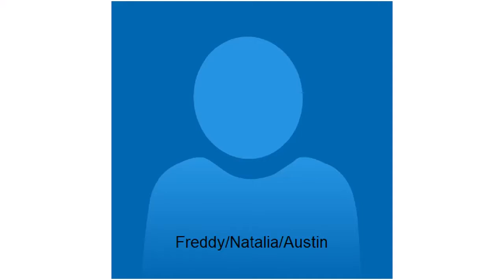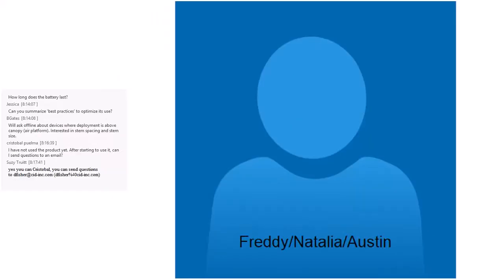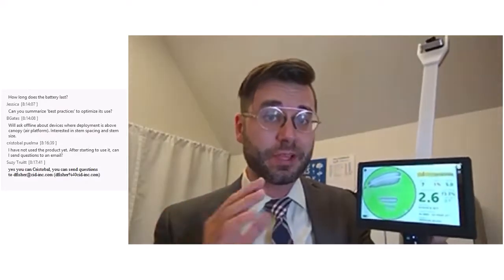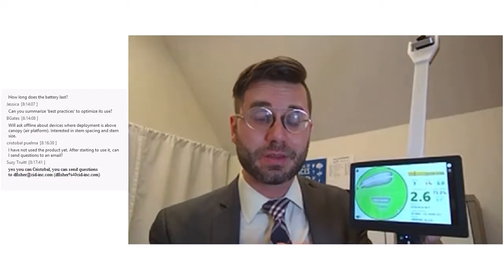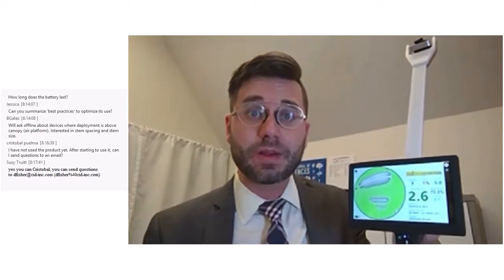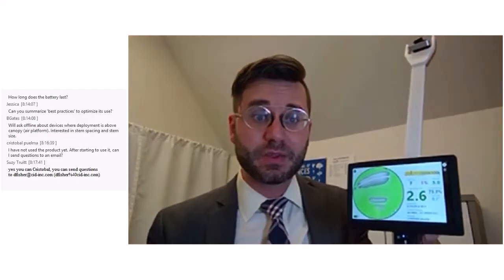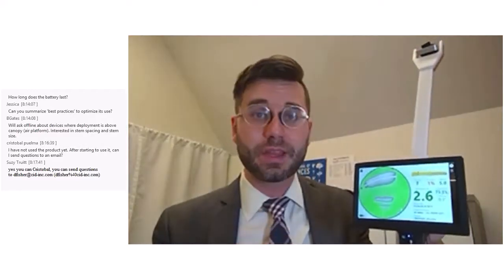Is it better to image on a sunny day or a cloudy day, or is it better to take only one point from a place, or take several points and have an average, for example, from a tree? We have this question. Oh, for that, it really depends on your application, but we have actually designed this to be acceptable sunny or cloudy. You are going to have a harder time getting a really fine resolution on a very sunny day, so I would say you want to try to avoid that.